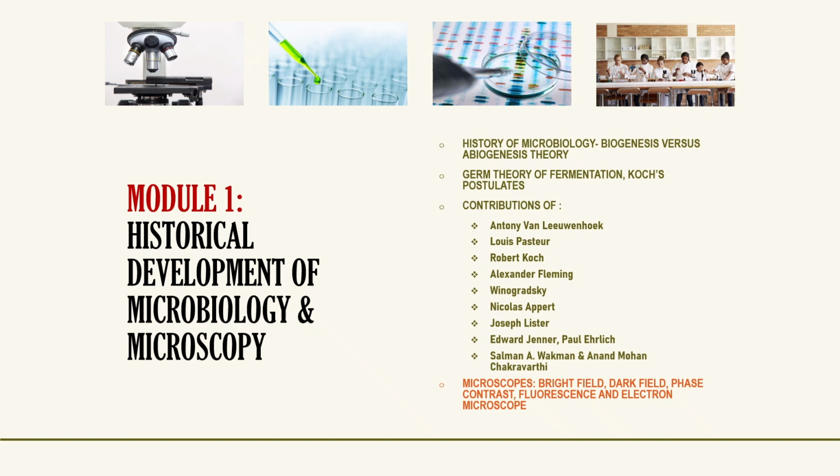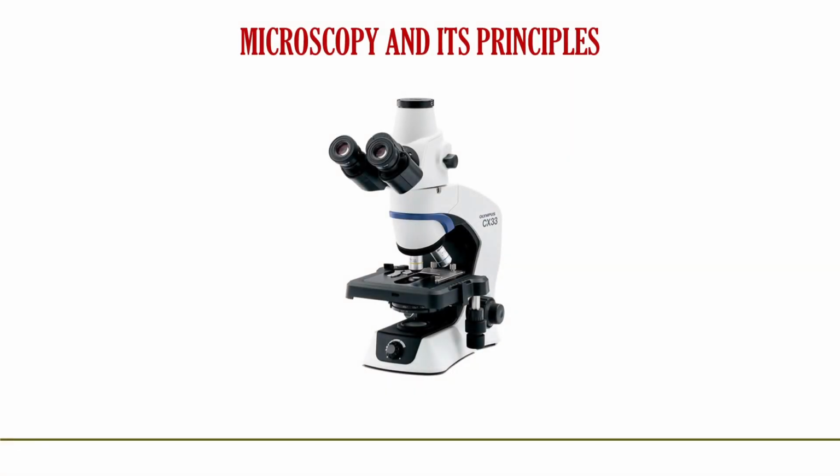We'll be zooming into the tiny world of light microscopes. From simple bright field to glowing fluorescence and the cool contrast tricks of dark field and phase contrast, each one shows us a whole new hidden universe. Let's dive in. Microscope and its optical principles.